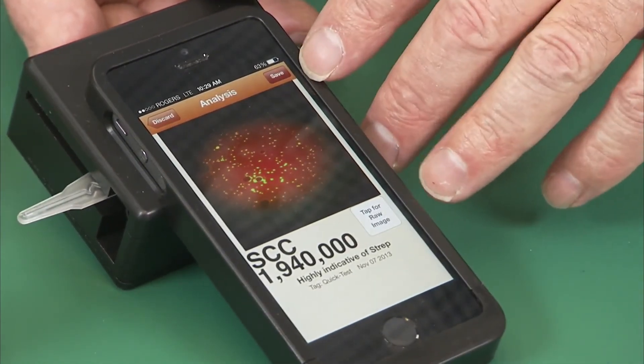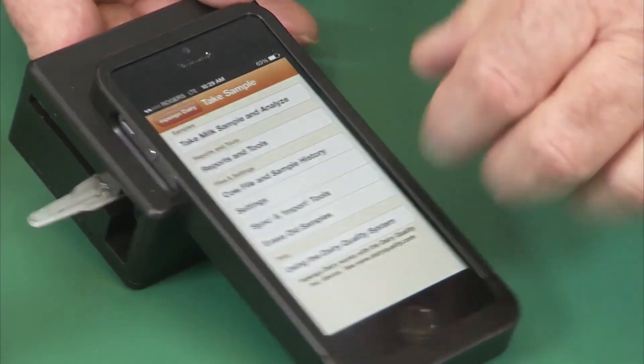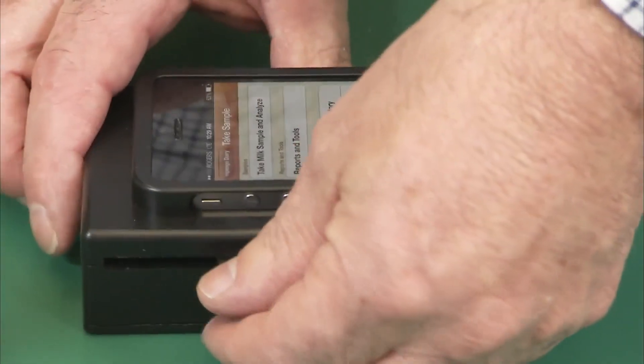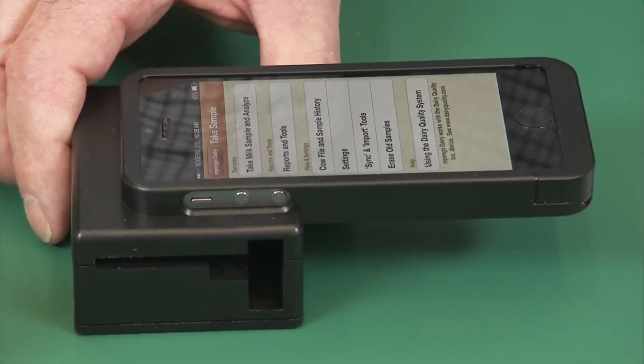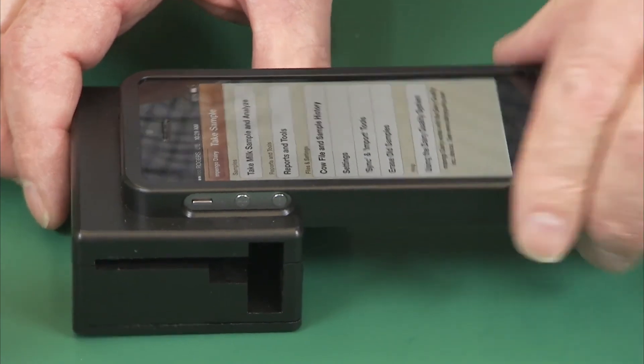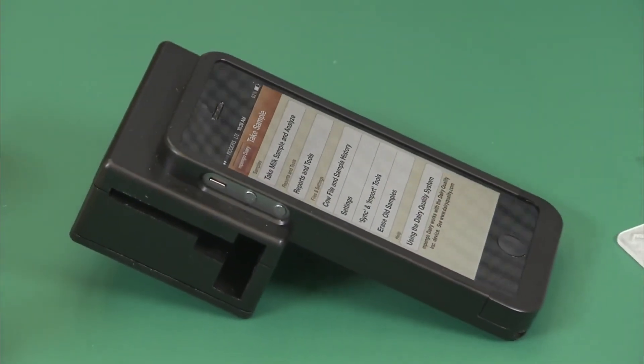We can save this sample — it can go to cow files. We then remove the cassette and we're ready to take another sample.